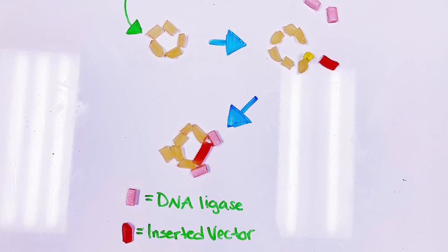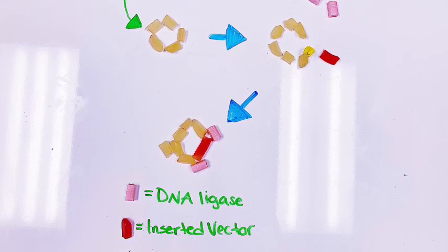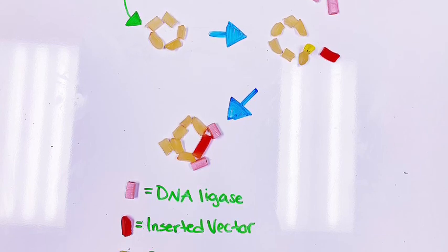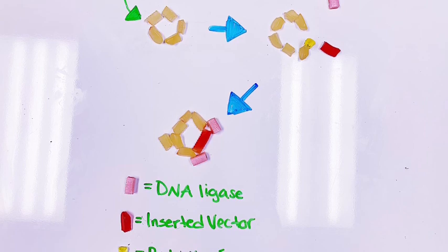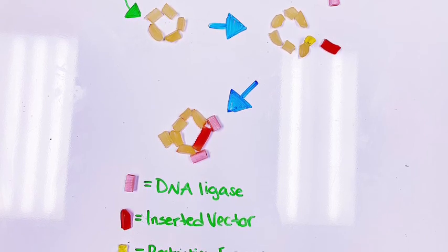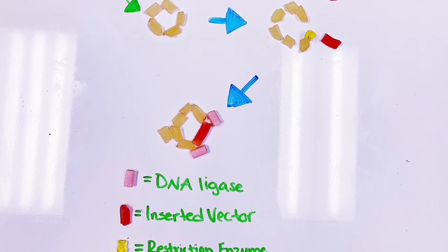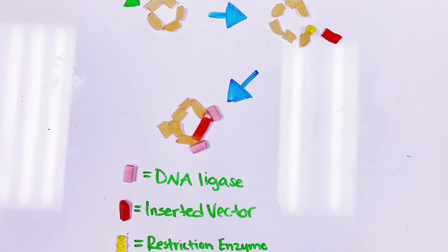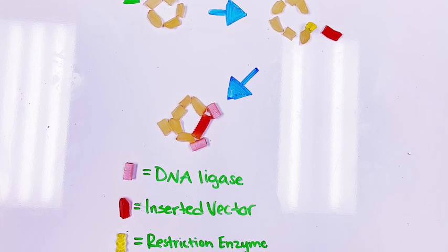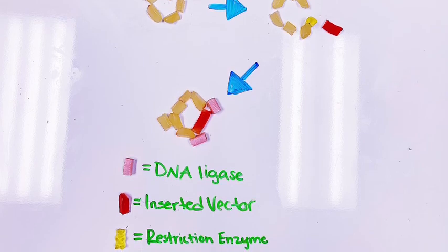DNA ligation is commonly used in molecular cloning projects to physically join a DNA vector to a gene of interest. The ends of the DNA fragments can be blunt or cohesive and must contain monophosphate groups on the 5' ends. Moreover, the covalent bonds are formed and a closed circular molecule is created that is capable of transforming a host bacterial strain. The recombinant plasmid maintained in the host is then available for amplification prior to downstream applications such as DNA sequencing, protein expression, or gene expression.